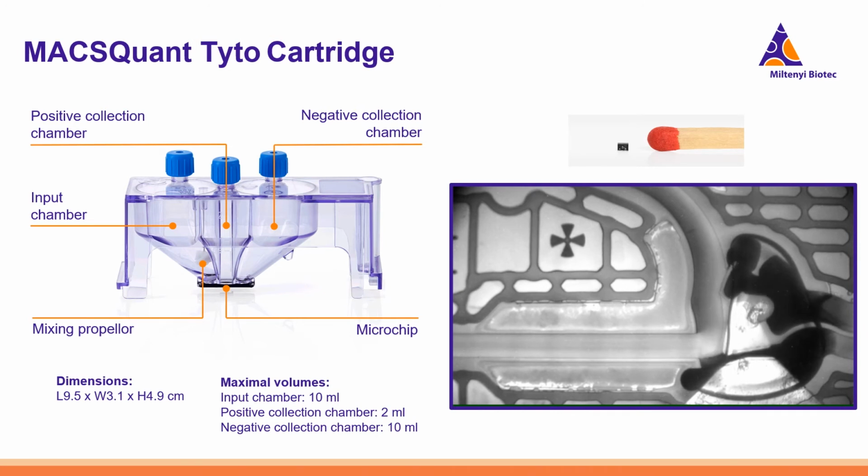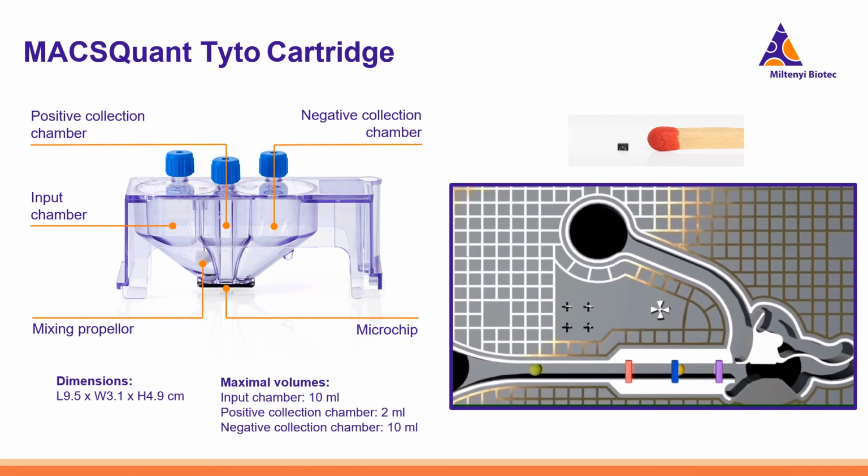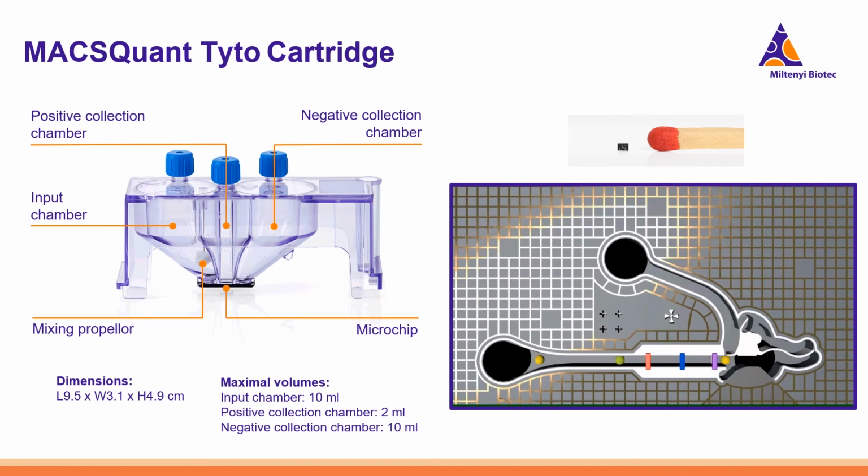What you can see here is a strobe capture of the moving microvalve, which can open and close up to 30,000 times per second. As said, once the cells pass the 3 lasers and a positive target cell has been identified, a magnetic pulse opens the valve, which then very gently redirects the cell into the positive collection chamber.